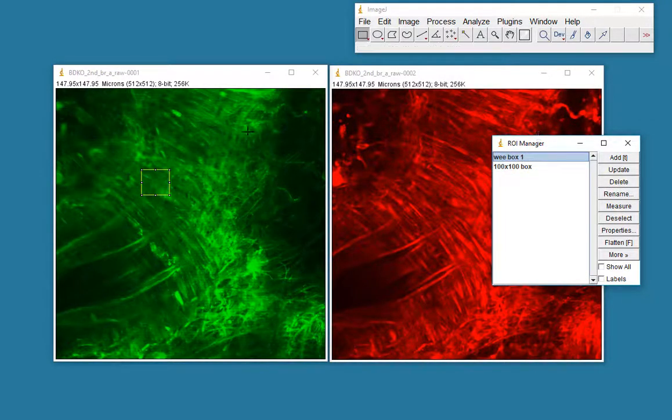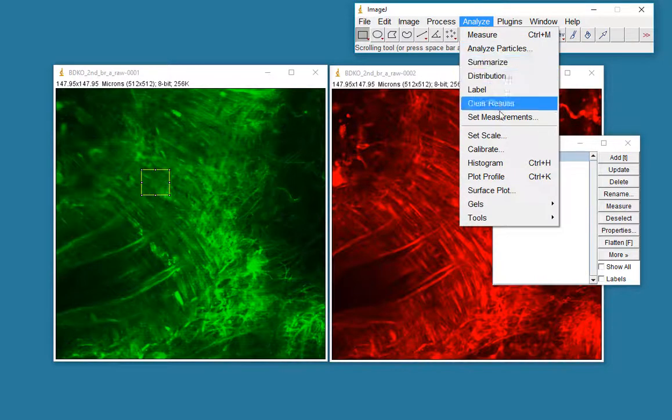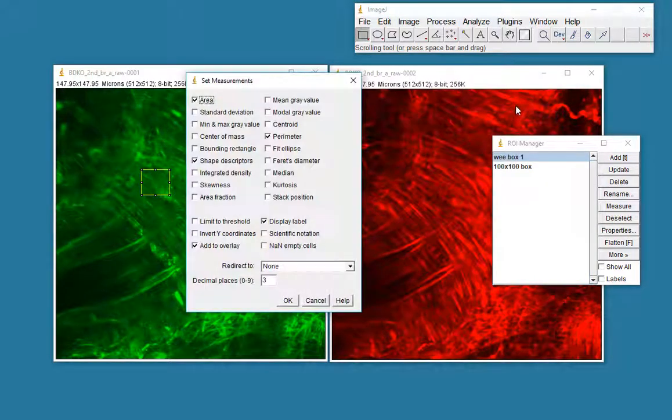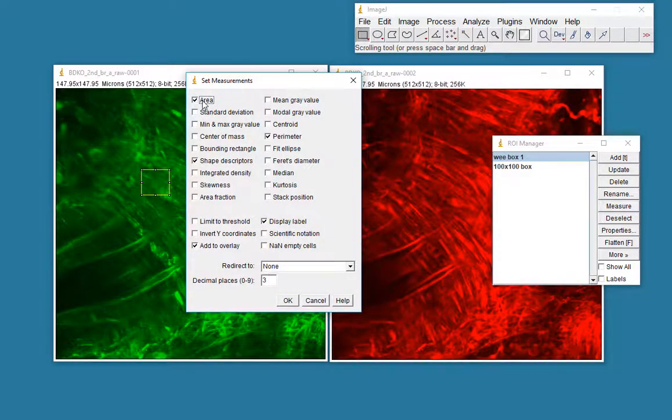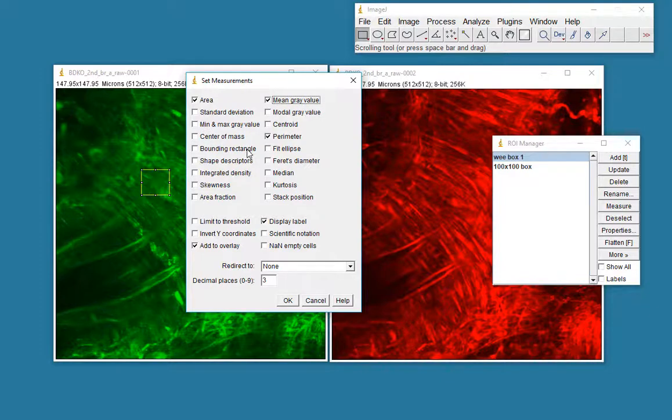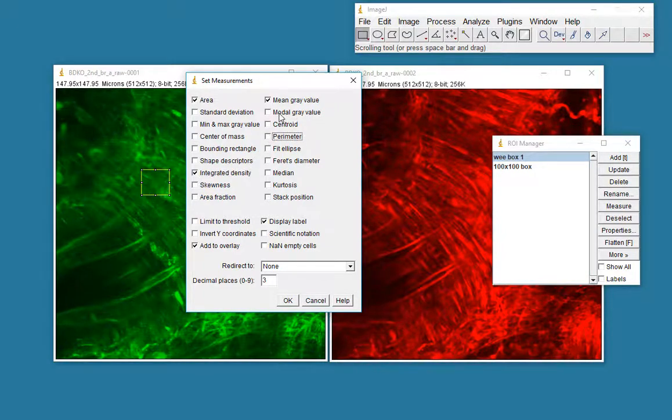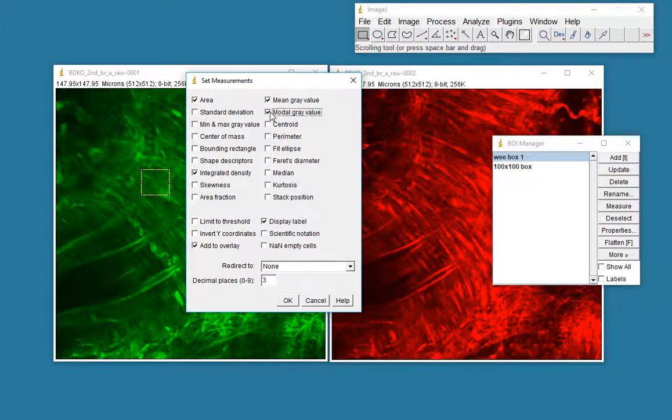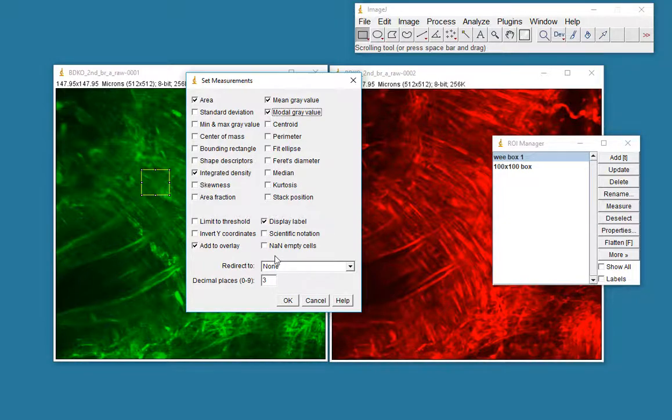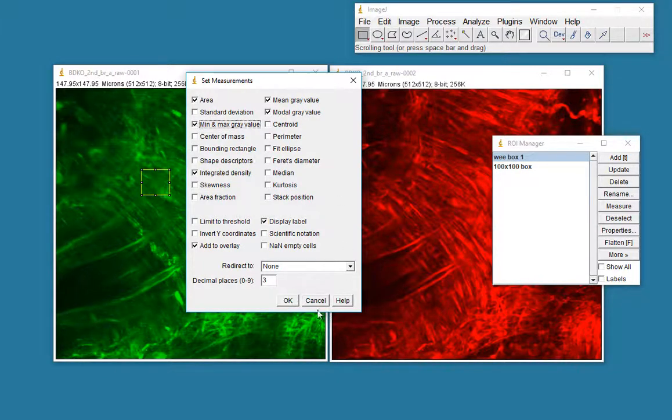Now we want to see what is the intensity within this box. I go to my analyze, set measurements, and decide what I want to know. So the area of the box, that might be helpful. Shape description, no, it's a square box. The mean intensity value could be useful. The integrated density, that's the total amount of fluorescence in that box. We don't need the perimeter. The modal gray value could be useful. That's the most common value within the intensity range. I think let's just go with that. Minimum and maximum gray values, that might be quite useful.